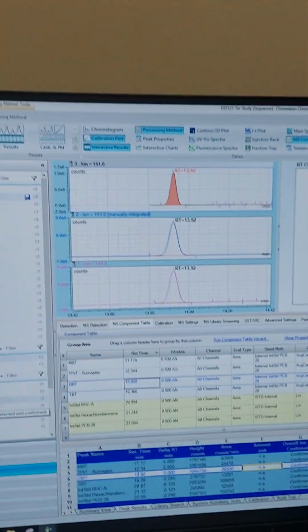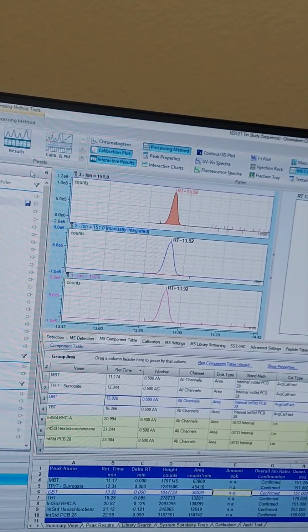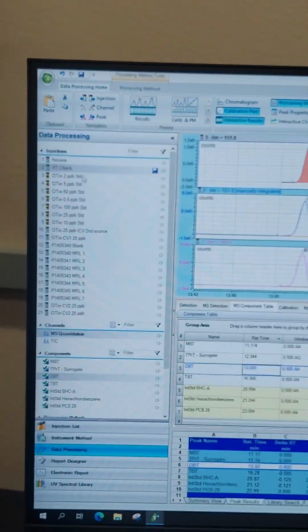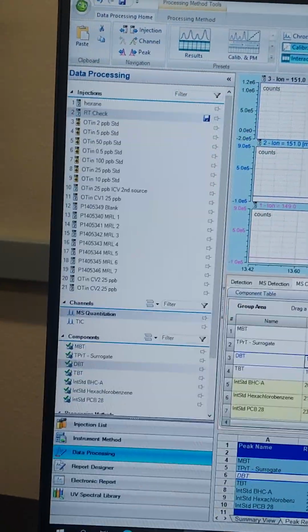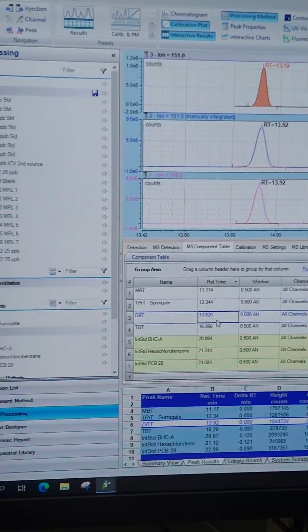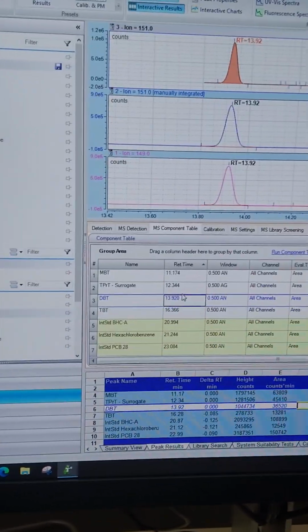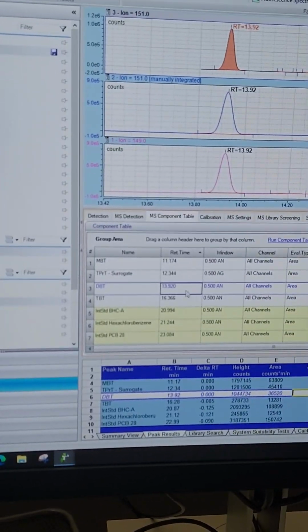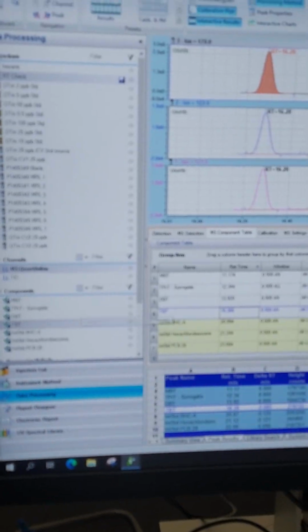So, what do you put in this vial? That vial is standard 5 RCV. Yes. So we're setting the instrument to have the retention times that standard 5 has. It's the middle one. That's the one we use to check our CV. So that's the best vial to have as a baseline. Okay, gotcha.